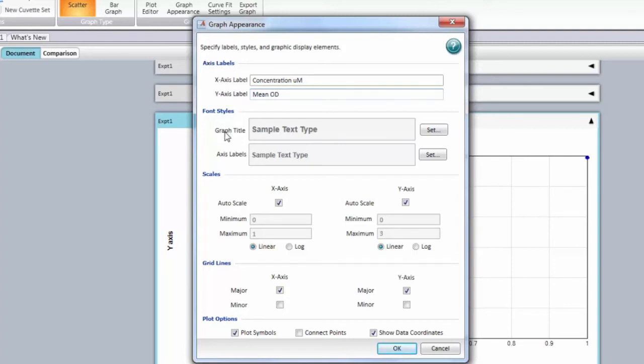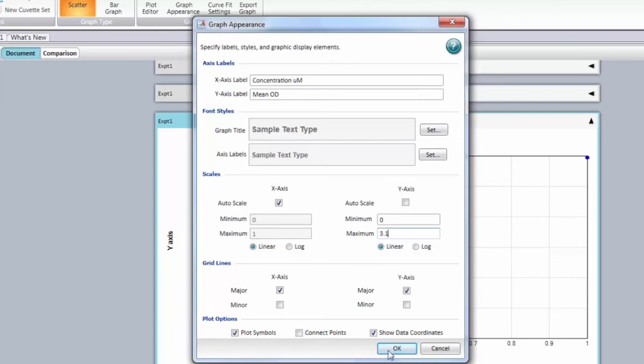You can change the font size, change the different scales. Here we're going to change the scales of the y-axis so we can really see the top of the curve. Then you can change all the options.